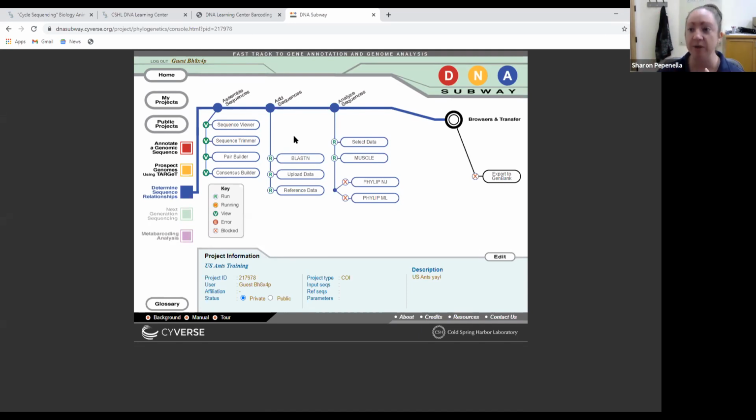So again, we search for plant, we search for invertebrate. So we're not necessarily bringing in viral DNA in here, which is something that we wouldn't normally look for. So that narrows down our database. It's still looking at sequences available in GenBank, but it makes it a much faster sequence comparison because we're not directly connecting to GenBank in real time.